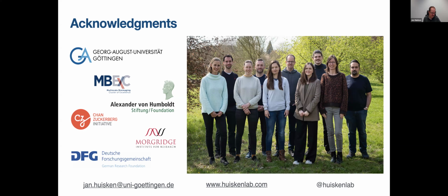Reaching other communities in other countries, sometimes it's easier to have a lab that we could collaborate with that would be able to build Flamingos, so we don't have to ship them all the way from Europe to Australia. So there's a lot of challenges and opportunities that we have to think about in the future, how to disseminate more Flamingos if that's what we want to do in the future.